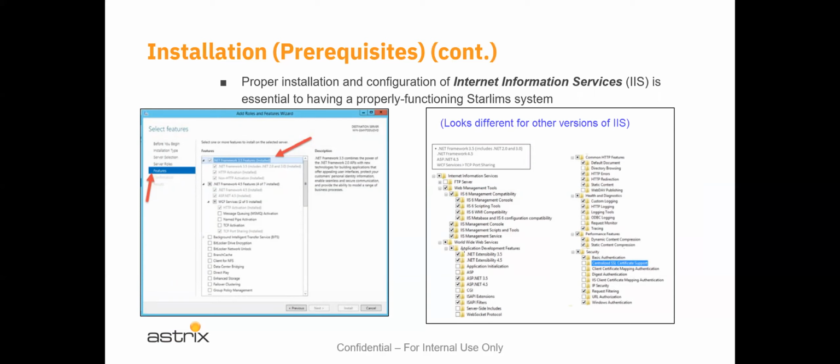So again, this is something that is typically done when you've already come onto a client project. It's already been done. But there may be instances, for example, when installing a new version, V12, that you'll have to go in and perhaps with the assistance of, or if they have nobody to do it at the client site, be familiarized enough with it that you can do it yourself and configure IIS on a Windows server.